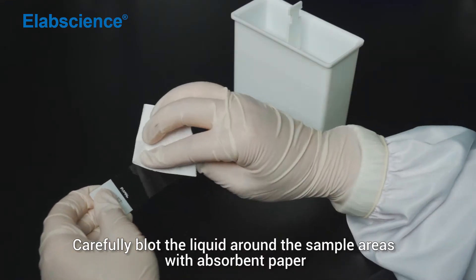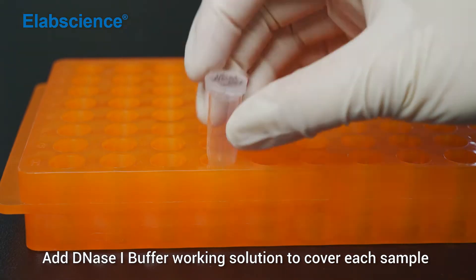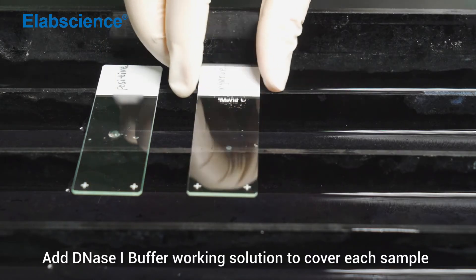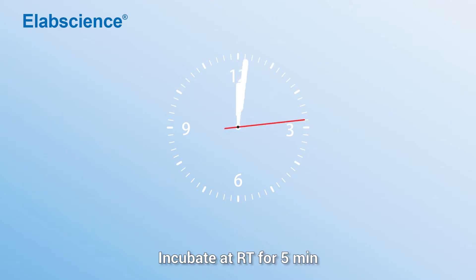Carefully blot the liquid around the sample areas with absorbent paper. Add DNS-1 buffer working solution to cover each sample. Incubate at room temperature for 5 minutes.